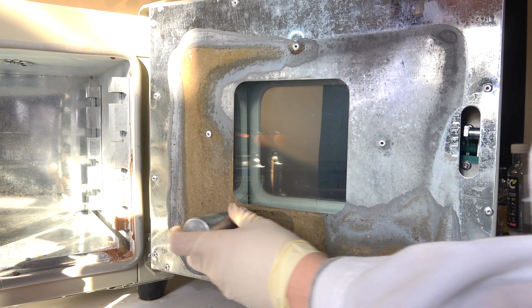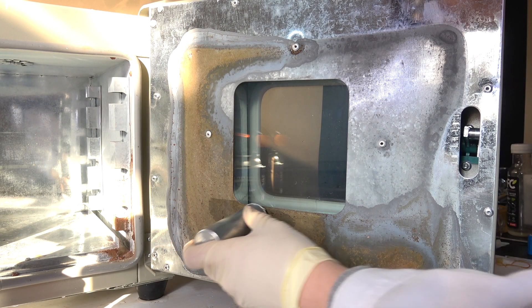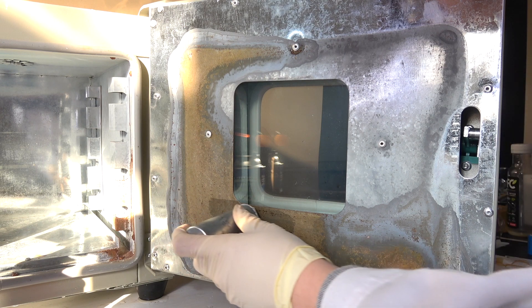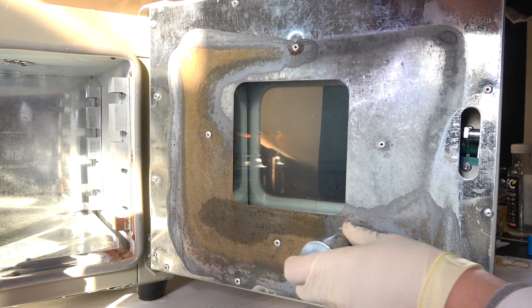Just before I explain how the whole thing works, notice that the panel I just cleaned is now once again covered by rust. This happened during the time I was preparing the electrolyte — it shows how vulnerable iron is towards oxidation without any protection.